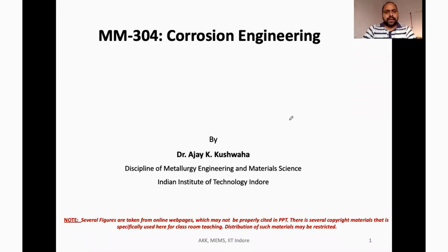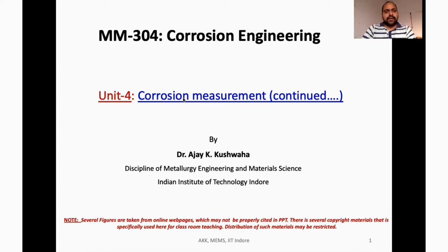So, in continuation to the previous discussion, we are going to discuss corrosion measurement. If we recall our previous discussion, we talked about what we mean by corrosion measurement and what kind of tools we can use for corrosion measurement and analysis. Out of which, we have talked about weight loss analysis and calculation of corrosion rate.